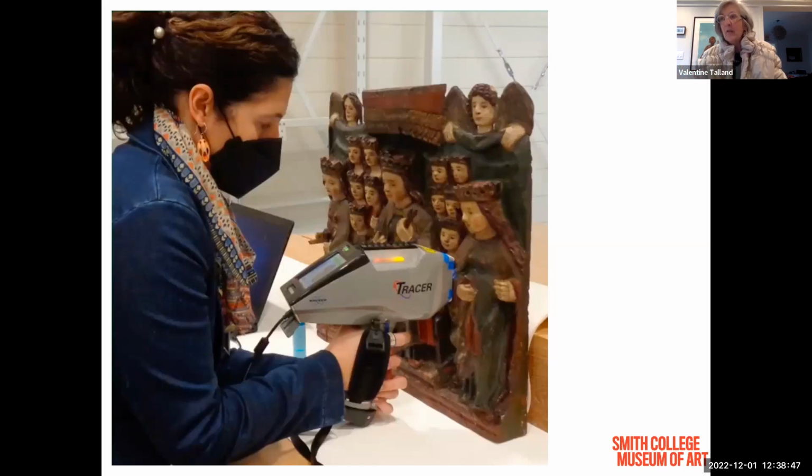Why is this good for the study of art? Well, X-ray fluorescence is really good at characterizing metal and metal compounds. And coincidentally, pigments that artists use tend to be or contain metals or metal compounds. So we can actually use it to characterize the actual pigments that an artist has used. And you're already probably assuming that one of the good things about that is if pigments have a certain date of use, and many of them do, then you can often determine things like when something was painted or when something was restored. So that's an explanation of the technique of X-ray fluorescence spectroscopy.